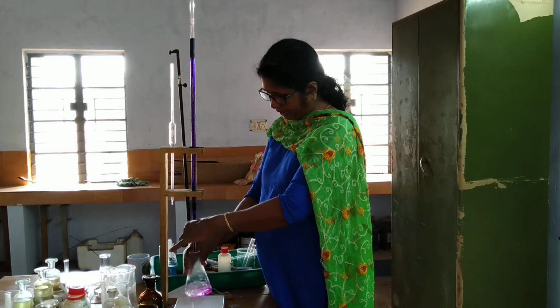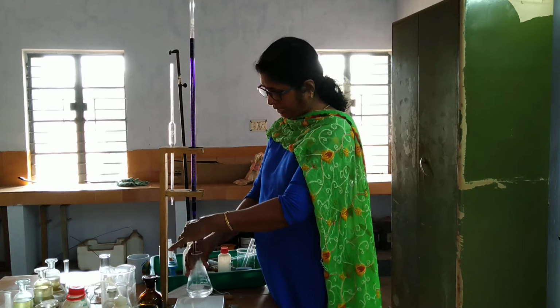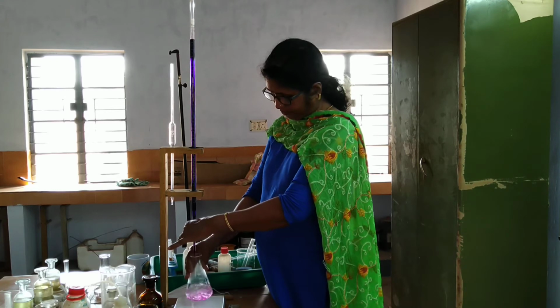I told you how to operate the burette. You will have to hold the stopcock with your left hand, like this it must be. The right hand you will use for swirling.